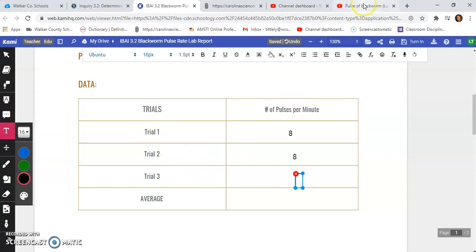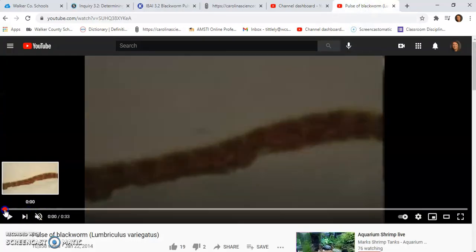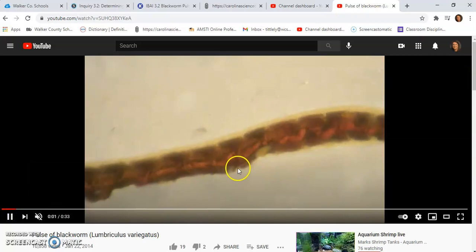Okay, and let's do trial 3 just to make sure our results and our count is consistent. Okay.